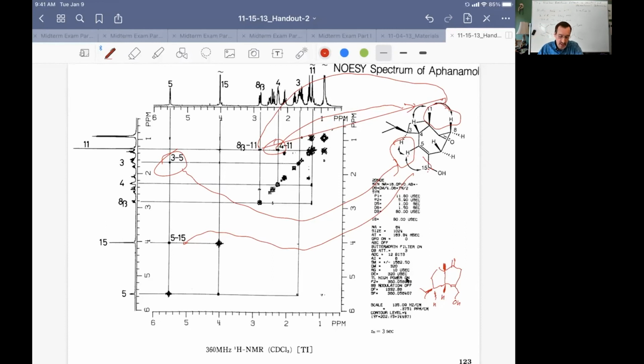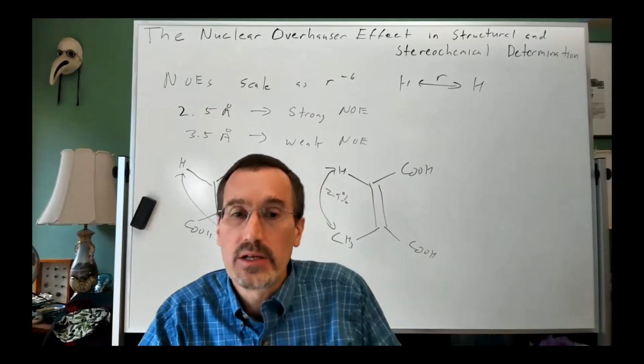That's going to be relevant in your work on strychnine because we're going to be talking about the conformation of one of the medium-sized rings in strychnine, and you're going to be looking at it through NOEs and coupling constants. So this is an example of a NOESY spectrum, a lot of data in one place, even possible in a nice crowded spectrum. Both are useful, both the 1D and the 2D spectra, and I will often do both 1D gradient NOEs and 2D gradient NOESYs.